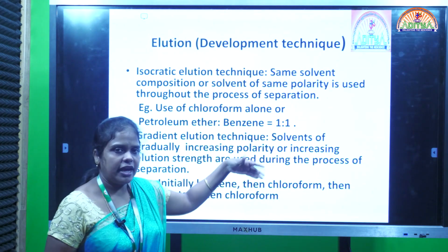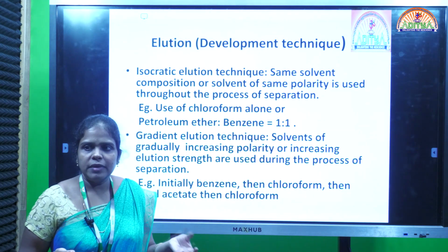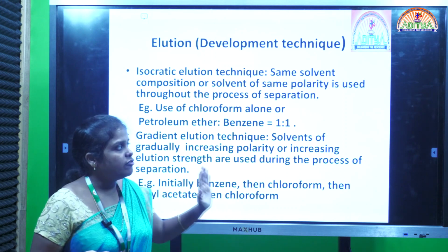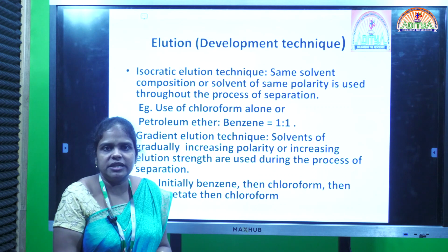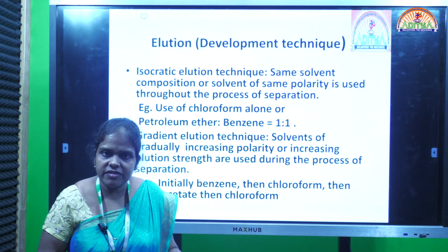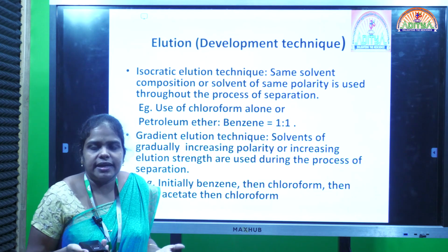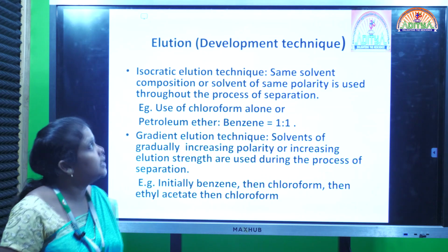After filling, everything is set up, that means you have taken the column, added everything, and then you have to leave the setup for some time. Why? You should not disturb it, to allow all the sample to get into the stationary phase, and separation or elution should get started. That is called the development or elution technique.